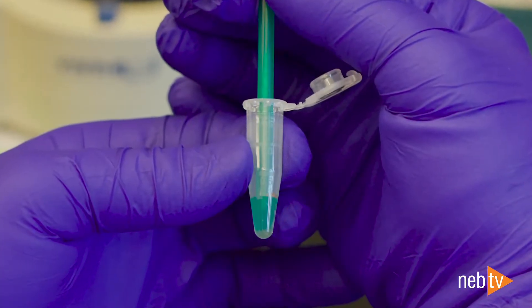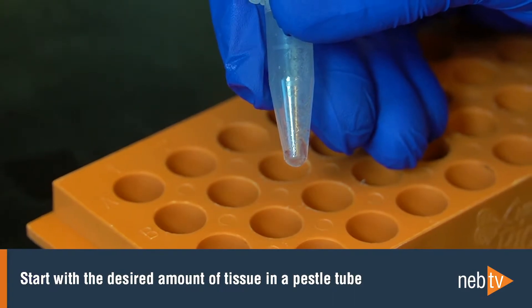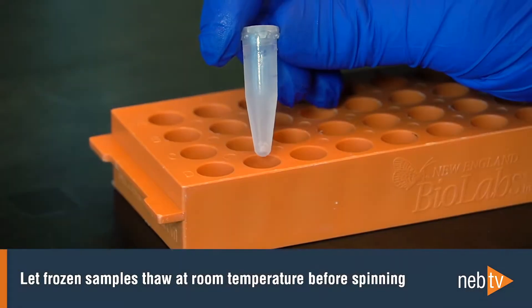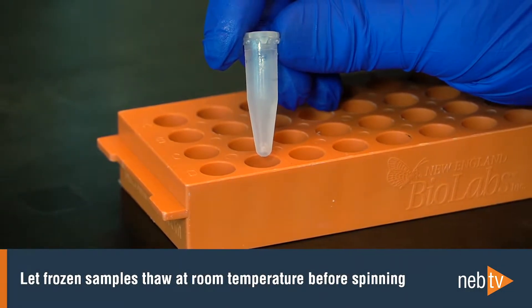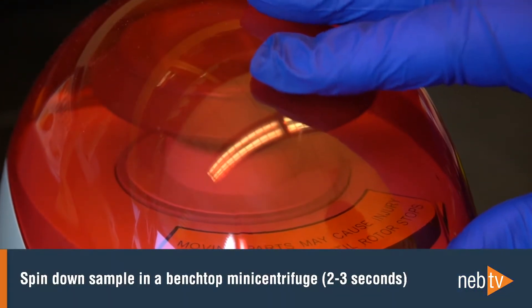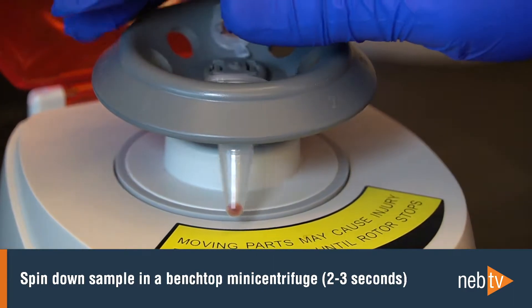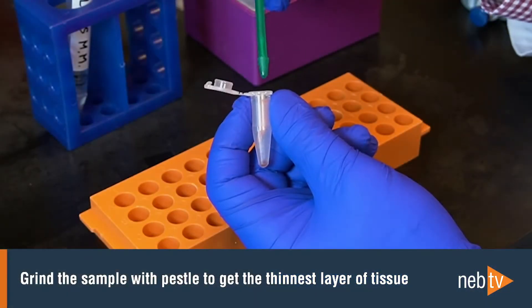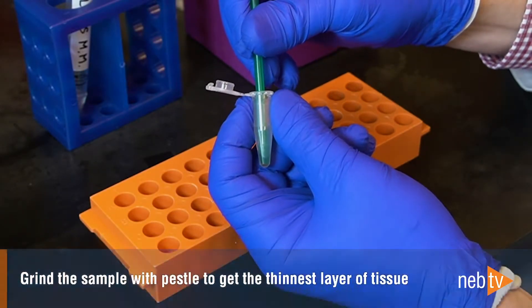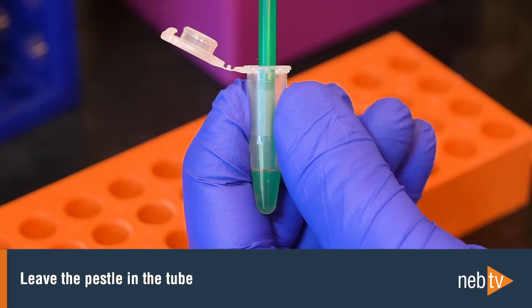First, we'll demonstrate homogenization with a PESL. Start with the desired amount of tissue in a PESL tube and make sure to keep fresh samples on ice and frozen samples on dry ice. Frozen samples should be thawed briefly at room temperature first. To begin the homogenization procedure, spin down the sample in a benchtop mini centrifuge to collect all the tissue material at the bottom of the tube. Grind the sample thoroughly using the PESL to get the thinnest possible layer of tissue. This will help speed up lysis and maximize DNA fragment length. Leave the PESL in the tube.